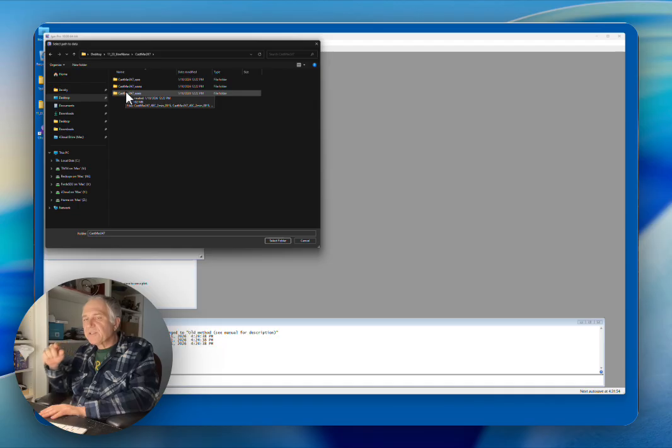So they get a very detailed understanding of how the phases change, and then when they reach some temperature they want to put in USAXS, WAXS, and so on. If you point yourself to a folder which does not contain anything about those WAXS measurements, you will never import them. But if you point yourself to the folder with most data, you will always import all of those and any existing from the other folders.